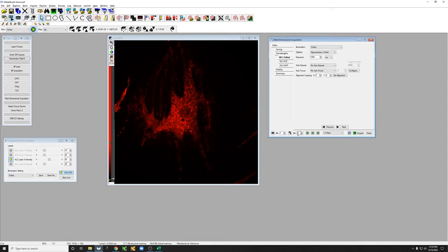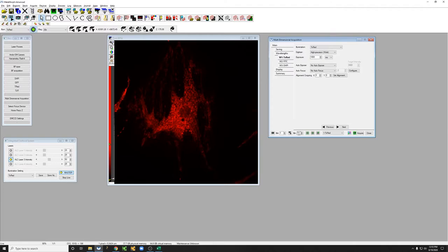The camera has sensitive elements on it that correspond to pixels in the image. If the binning is 1,1, this means that the mapping of those sensitive elements on the camera to pixels is 1 to 1.